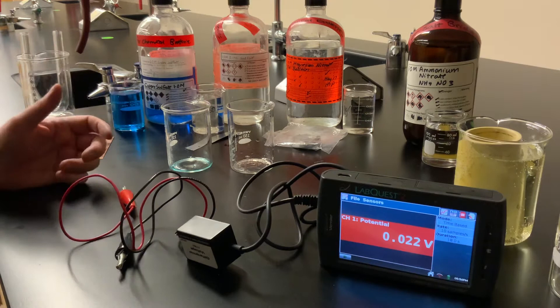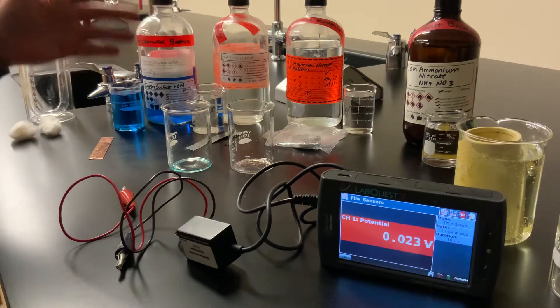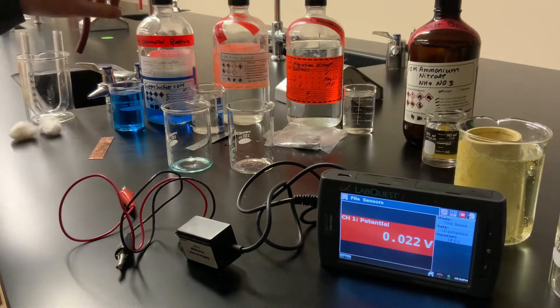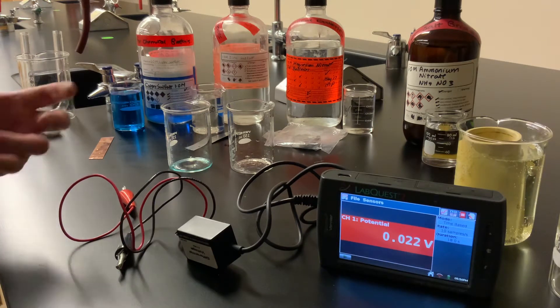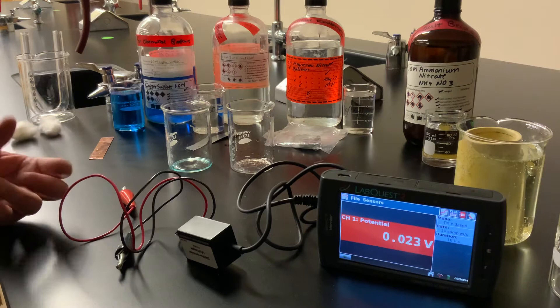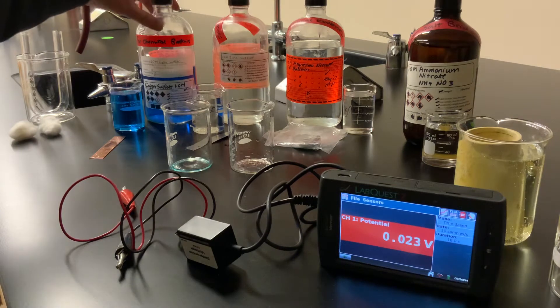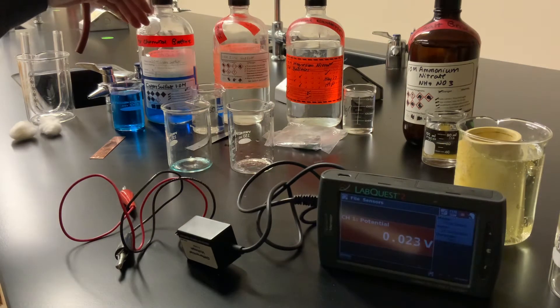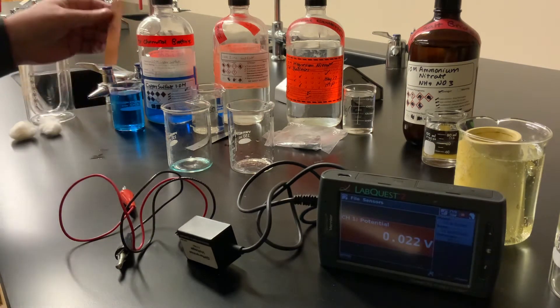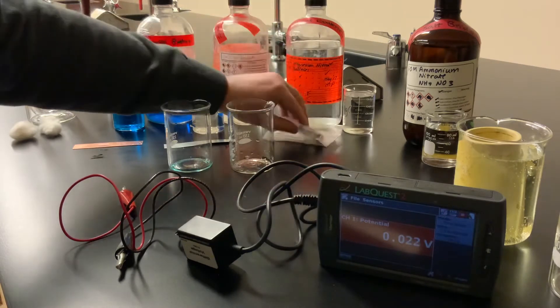The cell we're creating is going to be using solutions, so these are technically referred to as wet cells because they have solutions in them. An actual battery that you would use usually has some kind of moist paste inside — it's not filled with liquid, so those are referred to as dry cells. I've got three different solutions here: copper sulfate, zinc sulfate, and magnesium nitrate, all at one molar concentrations. We've also got strips of metal — copper, zinc, and magnesium — which will serve as the metal electrodes in our cells.